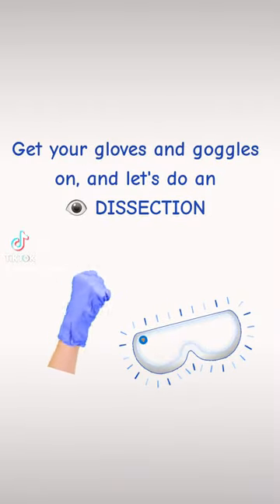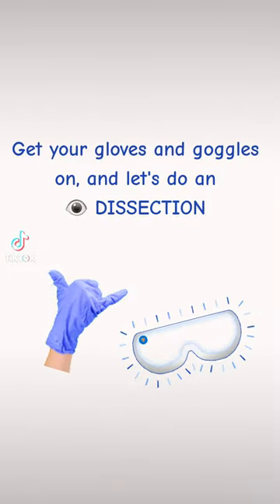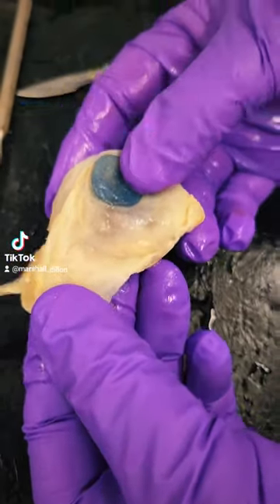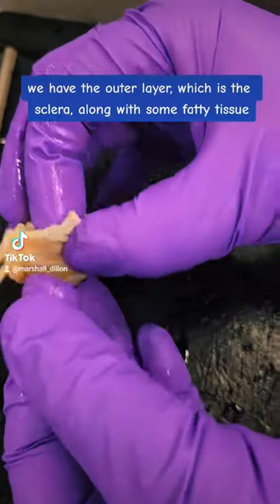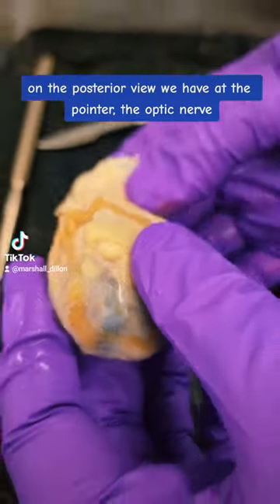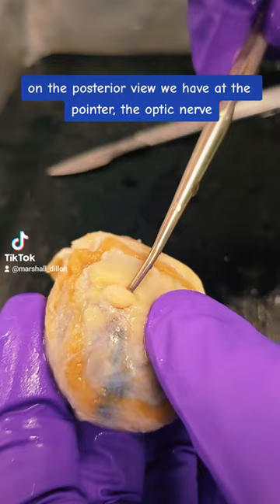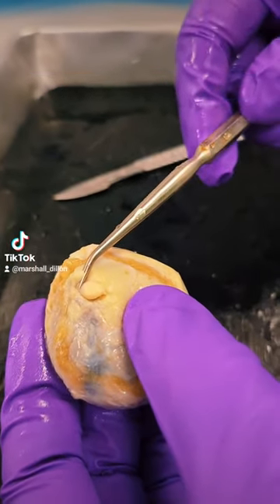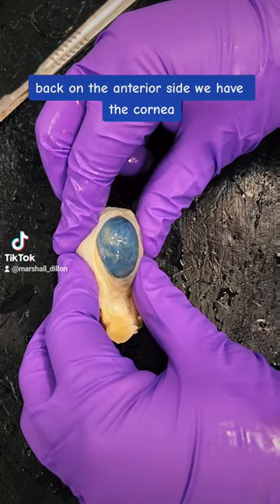Get your gloves and goggles on and let's do an eye dissection. We'll start on the anterior side of the eye. We have the outer layer, which is the sclera, along with some fatty tissue. On the posterior view we have at the pointer the optic nerve. Back on the anterior side we have the cornea.